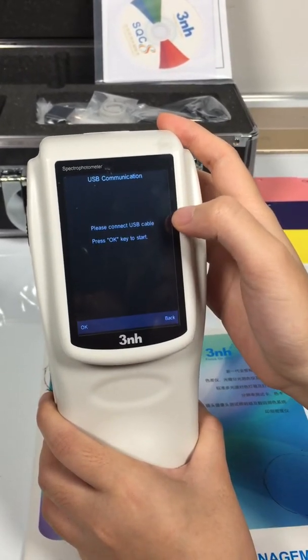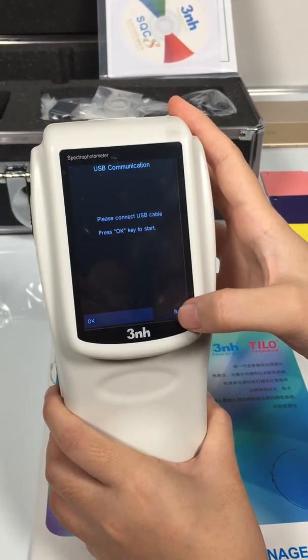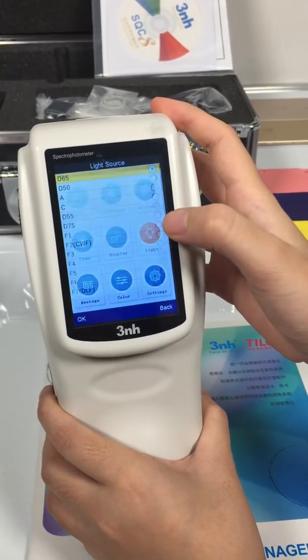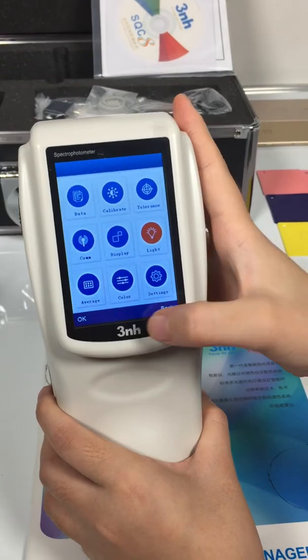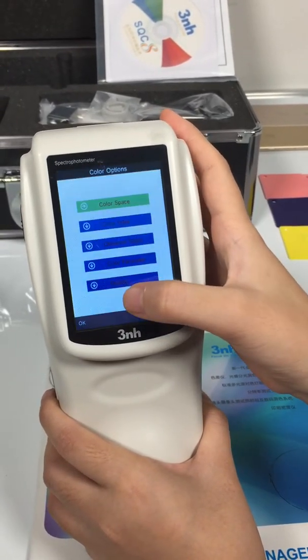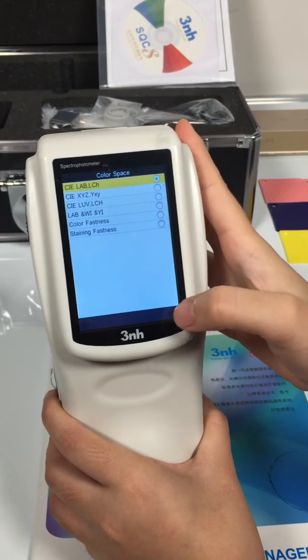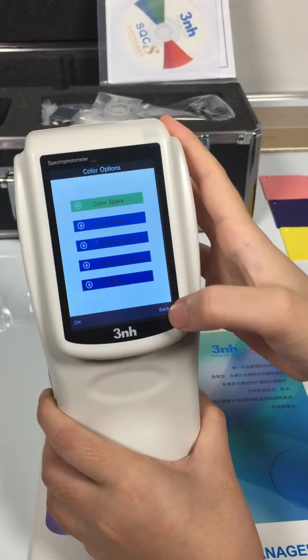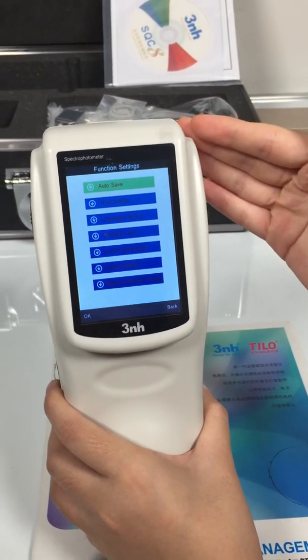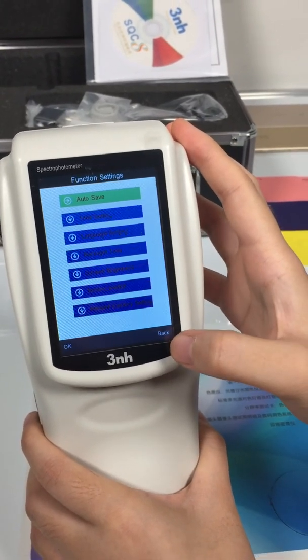Communication — this is for connecting the machine with your computer. Light source selection. Average measurements. Color space: you need to notice the color space, you can select it as a related setting. This is the setting for the whole machine. That's all, thanks for your attention.